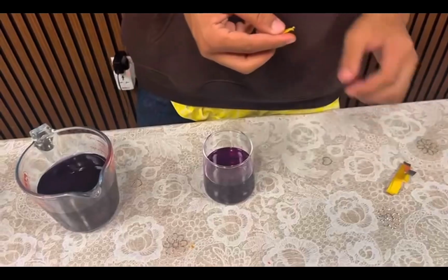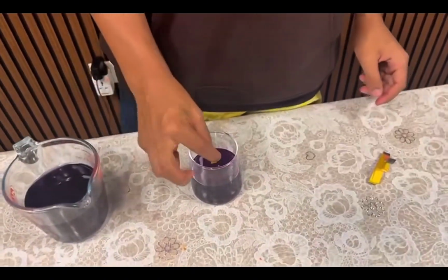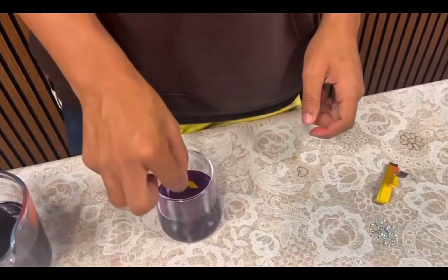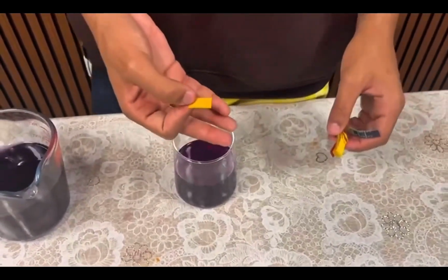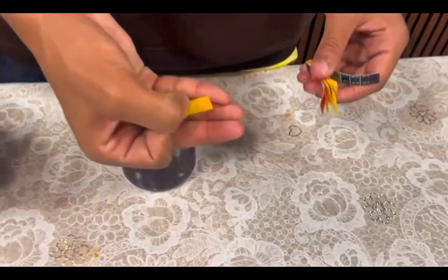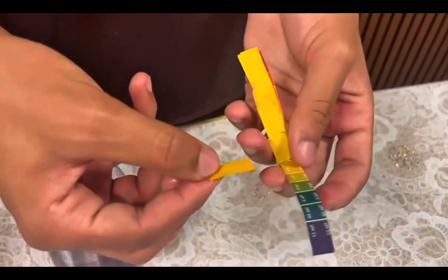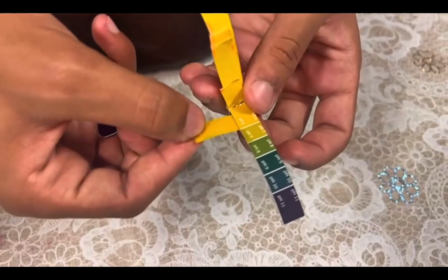We need to double check the pH still, of course, and make sure it's at the correct acidity. Let's see. Water is, yeah, there's about no color change. It's neutral. Around there, as you can see, 6.